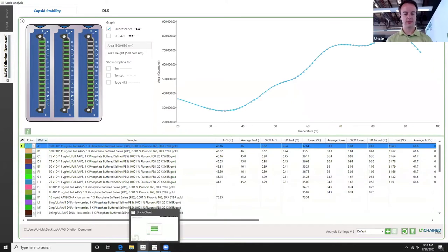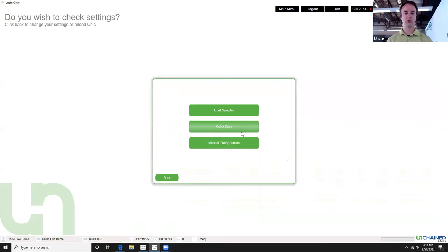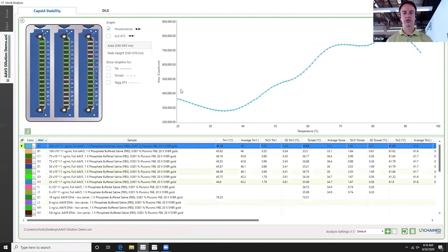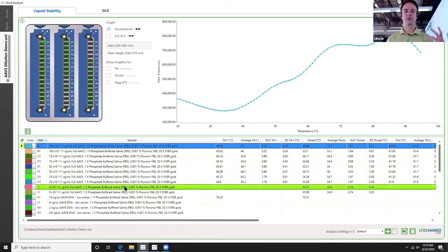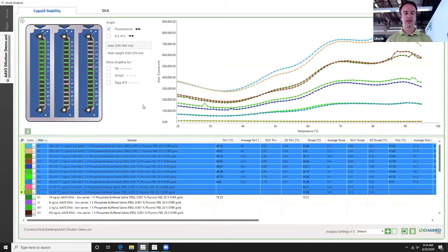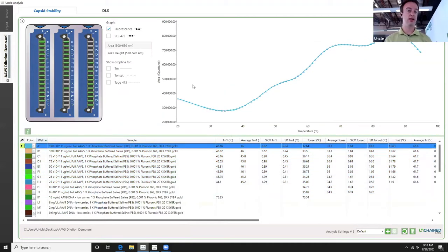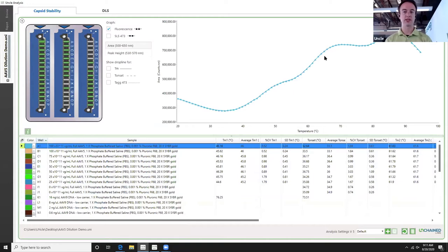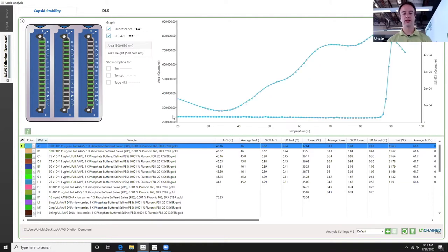Here's a quick look at that capsid stability result. I have some pre-run results from an AAV sample that I ran earlier. In this case, we start with the dilution series of AAV5. Starting with the highest concentration sample, we begin with some initial fluorescence intensity based on how much free DNA is in my sample. Then from there, the temperature ramp heats the sample up and you can see increases in SYBR Gold fluorescence that correspond to ejection events of DNA from the capsids. If we want to investigate aggregation at the same time, I can simply overlay the SLS signal and get an idea of when capsid aggregation starts to occur.